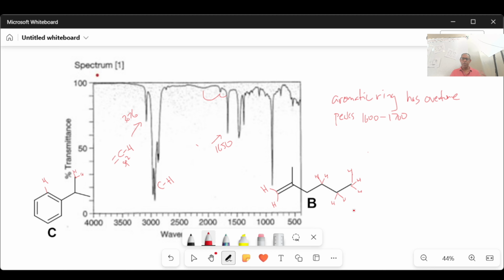In most cases, understand that we'll also have other data to really match the compounds. But you can use the maximum knowledge you have to solve using only IR. For example, you could be given molecular weight from mass spec.